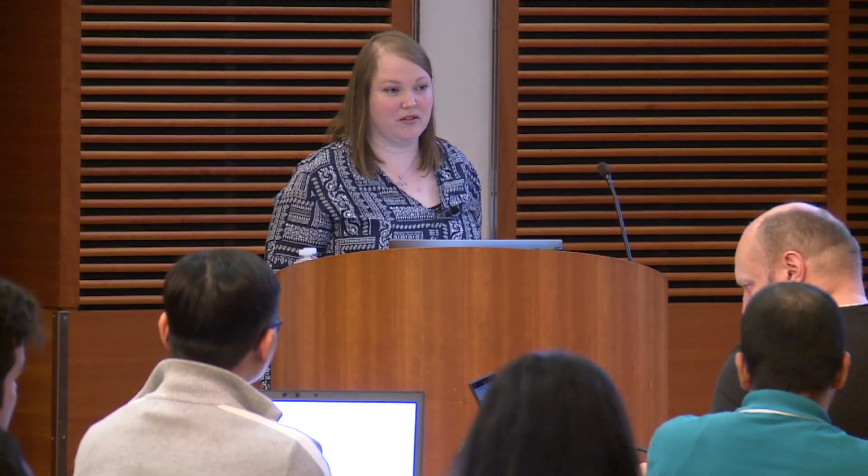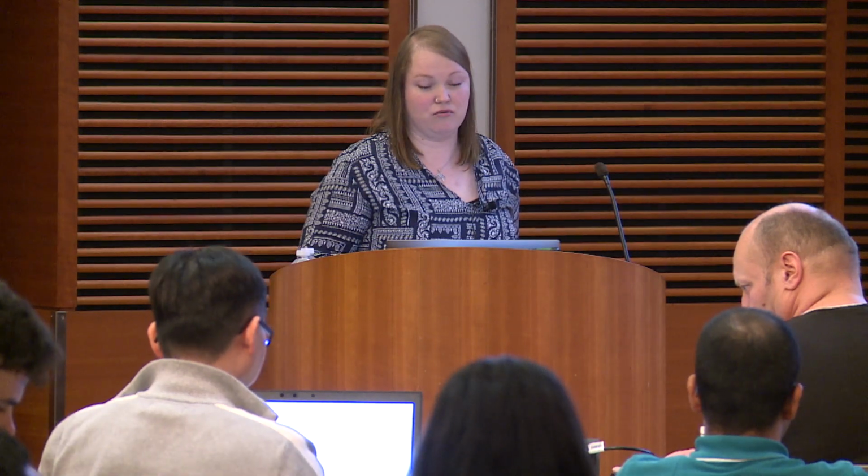Let me start with the first lecture, and I will talk about the MaxQuant basics. I will introduce MaxQuant, and then I will also describe the implemented workflow there. I will cover one part, and then there is also MaxQuant Basics 2, where the session is tomorrow, and this will then be presented by Jürgen.